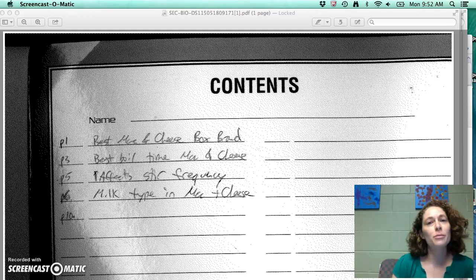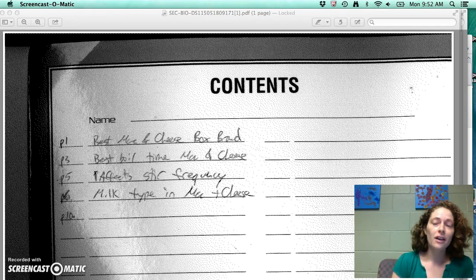All right, so keeping a lab notebook is something that you're going to do each week in lab. It's an important part of being a scientist. It's sort of like your own personal diary, but that's also shared with everybody else. So basically the lab notebook's purpose is so that you can go back in time and that you or others looking at it could determine exactly what experiment you did, under exactly what conditions, so that they could actually reproduce that experiment for themselves, or they could just look at exactly what you did, see what data you got, and use that so they don't have to repeat work that you've already done.